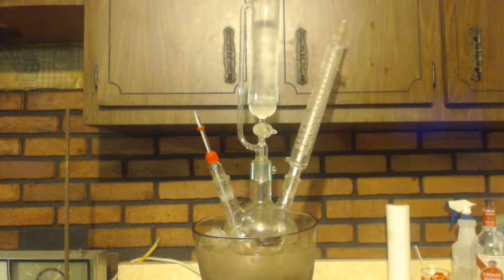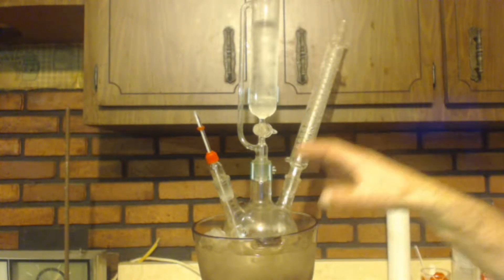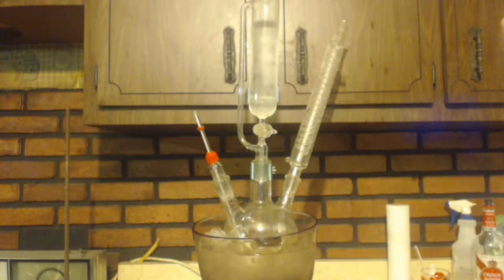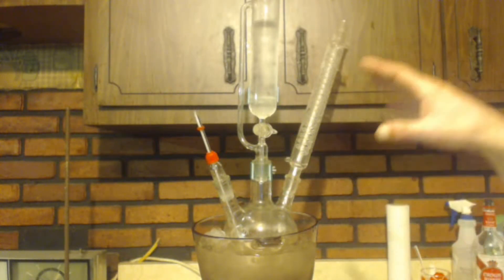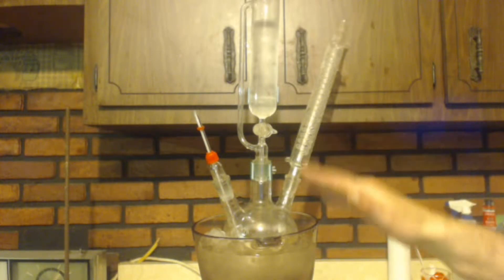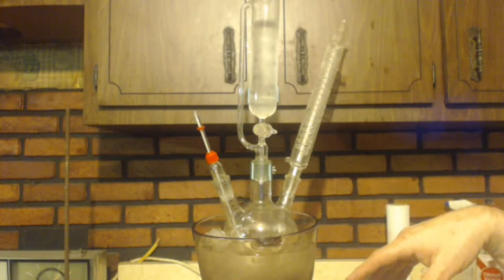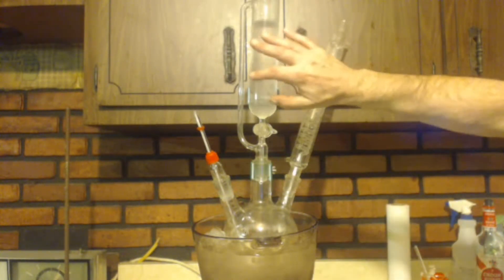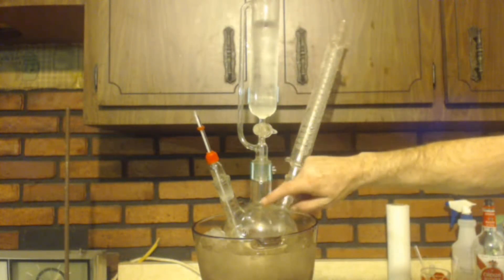On the propanoic acid video, the product was the salt of a carboxylic acid — bromomagnesium propanoate. Here we have the salt of a tertiary alcohol, a tertiary alkoxide. To convert the salt into the actual alcohol, just like in the propanoic acid synthesis, we're going to add acid. But we don't want hydrochloric acid like we used before — it's too strong and too exothermic. Instead we'll use cold water, and I have an ice bath here. You can see the product is all solidified inside — I can't even move the thermometer.